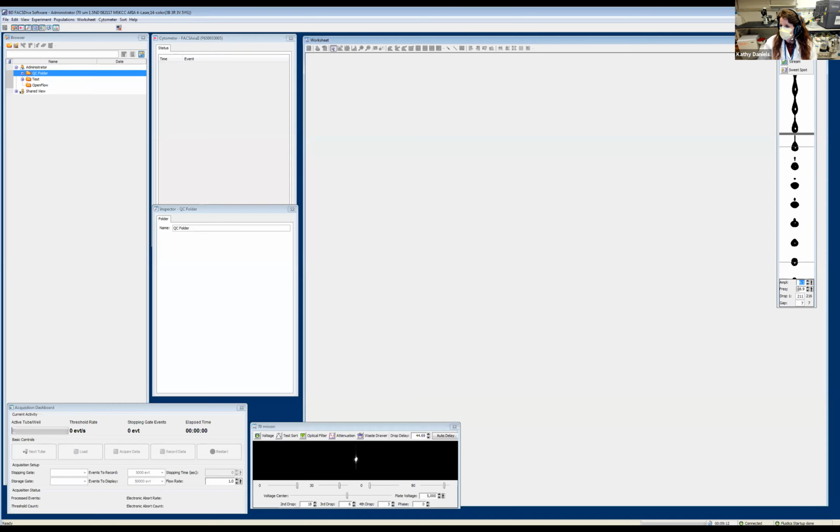With the 70 micron nozzle, we typically run at about 88,000 hertz, or 88 kilohertz, right? That means at this point, right now, we're generating 88,900 droplets every second at the instrument. The amplitude is what we can apply to adjust where this drop one position is at the instrument, or on the droplet camera, right?